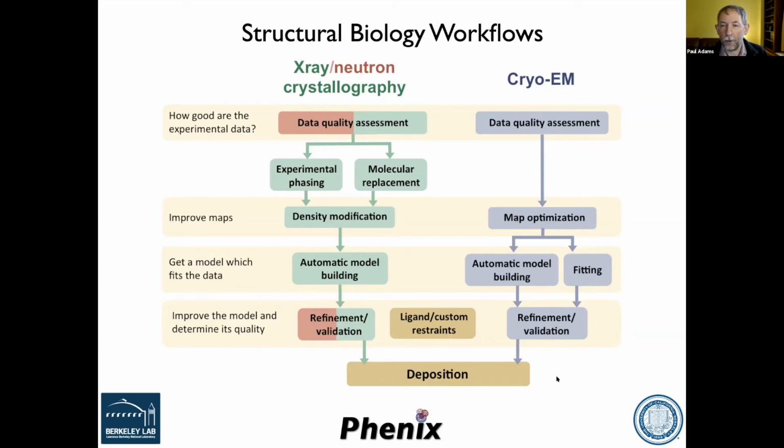So the good thing is that a lot of the steps are the same, and it turns out that we can modify or expand on things developed in crystallography to develop tools for the cryo-EM case. Again, the details are different and things need to be changed, so it's not exactly the same, but the great thing for us within the PHENIX team was that we could leverage a lot of what we've done already to build tools for electron microscopy quite quickly.